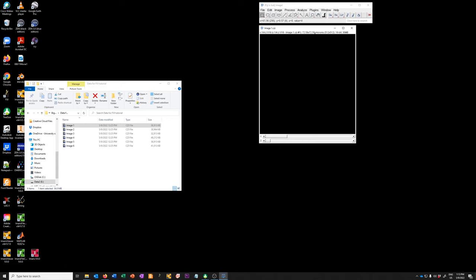There are different ways the data can be displayed, and fresh out of the box Fiji displays on a grayscale. Whenever you're trying to look at and adjust how an image looks — especially a multi-dimensional one — there are two control elements you want open alongside the image. Go to Image > Adjust > Brightness and Contrast (also Ctrl+Shift+C), and Image > Color > Channels Tool (also Ctrl+Shift+Z).